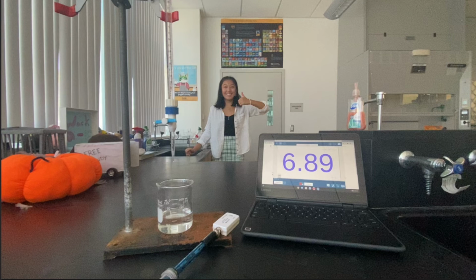Now that you've chosen your chemicals and indicator, it is important to consider some of these elements of experimental design to obtain the most accurate results. Here is the setup of the experiment. The burette will contain the titrant, and the beaker will contain the analyte.